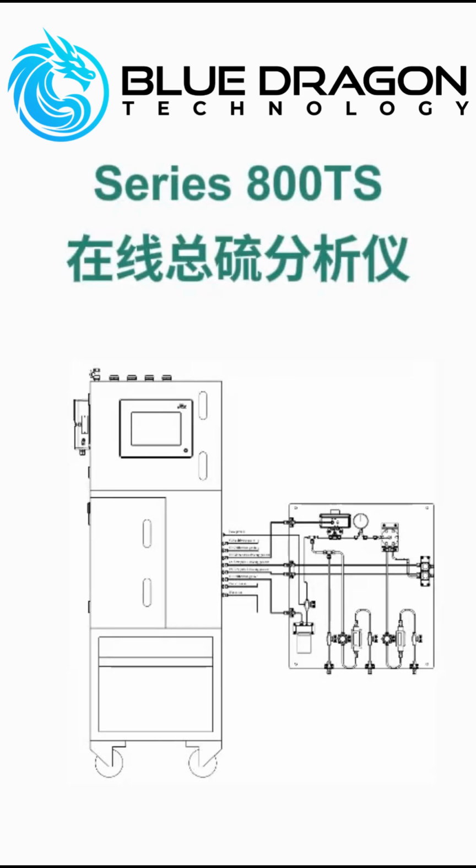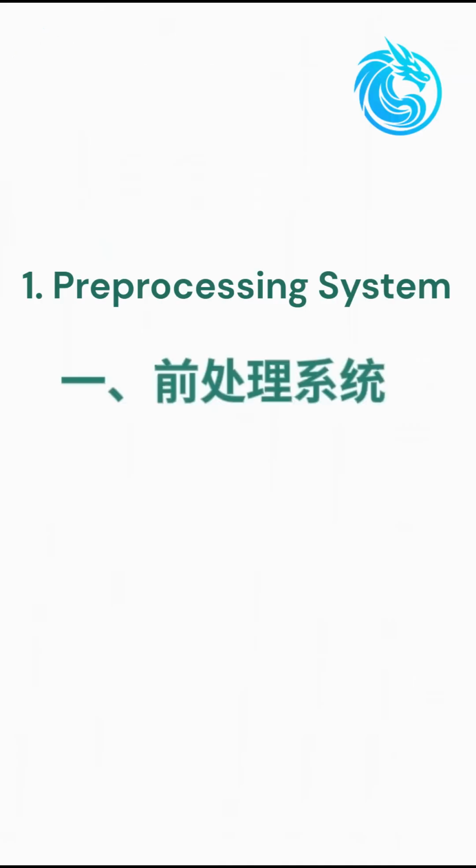Blue Dragon Series 800TS Online Total Sulfur Analyzer. Preprocessing System.